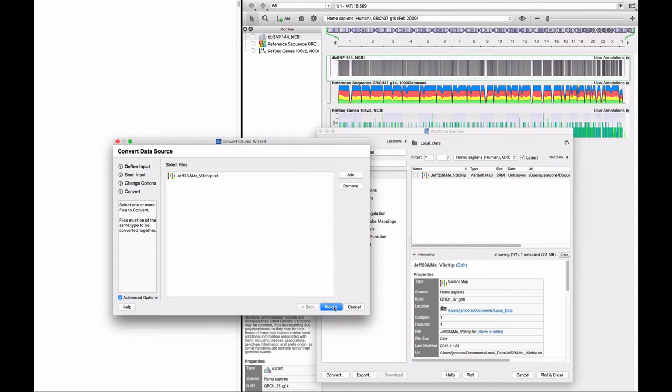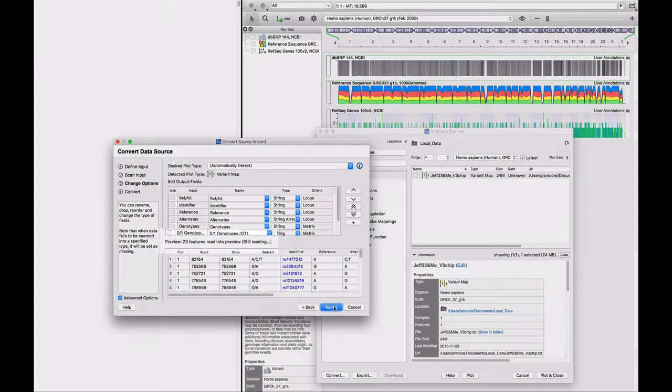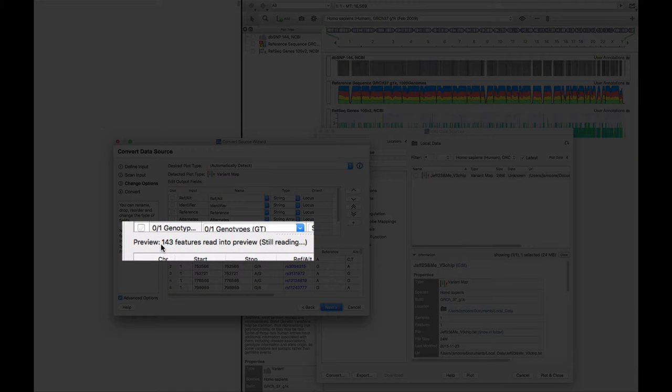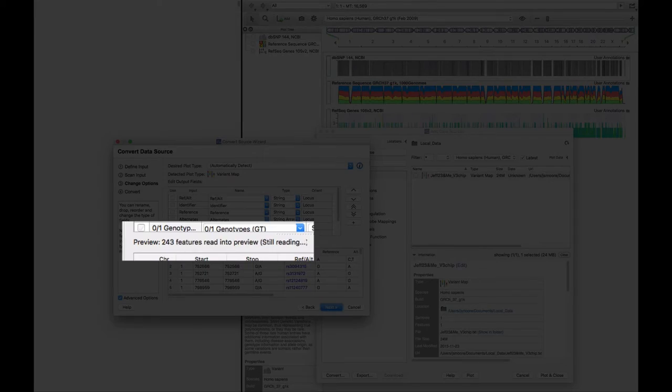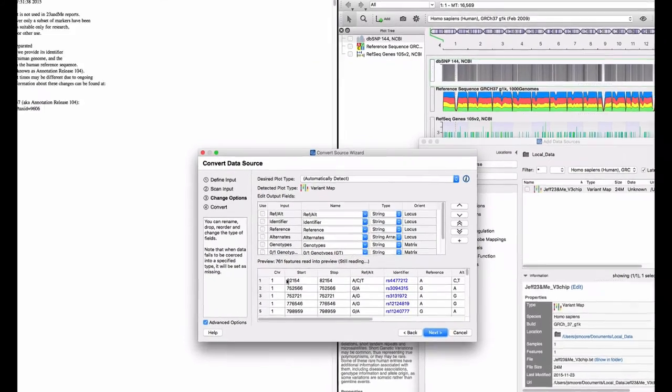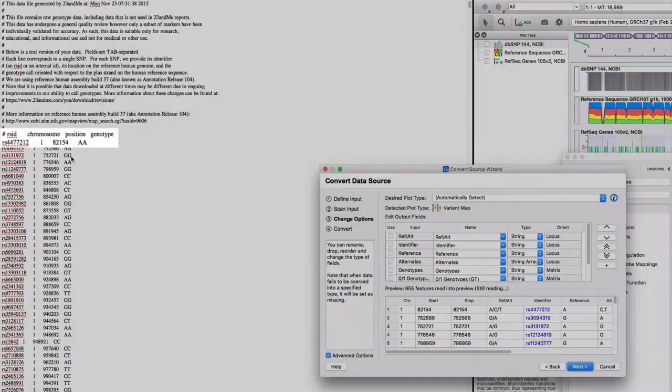Then go to the next screen. A sample of converted data is prepared for evaluation purposes. Let's compare the converted data to the raw data.